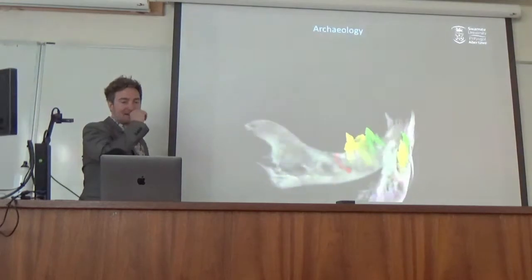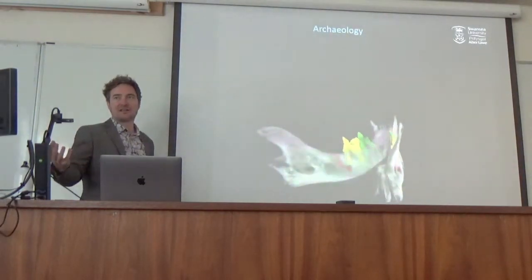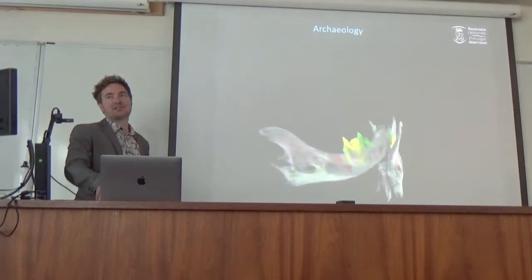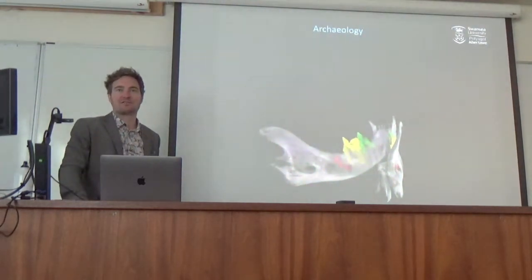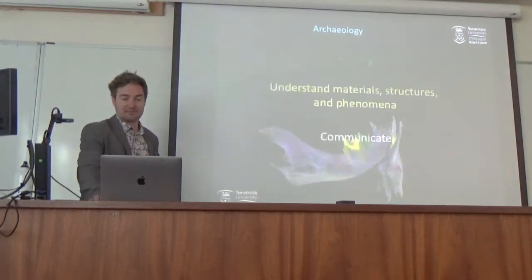And when we looked at the neck, it looked like there were indications of strangulation. So we potentially have an age and a hypothesis for a cause of death. I'm always wary of saying a cause of death, but it could be.